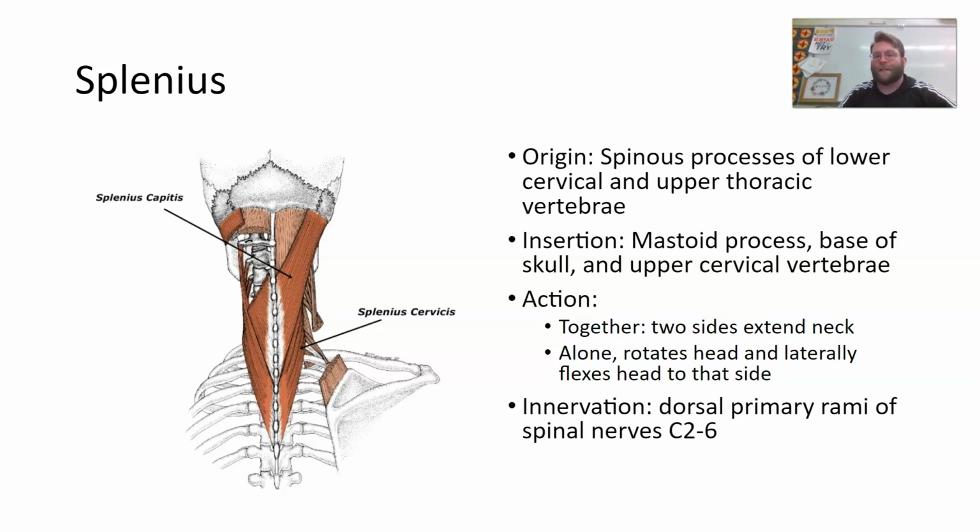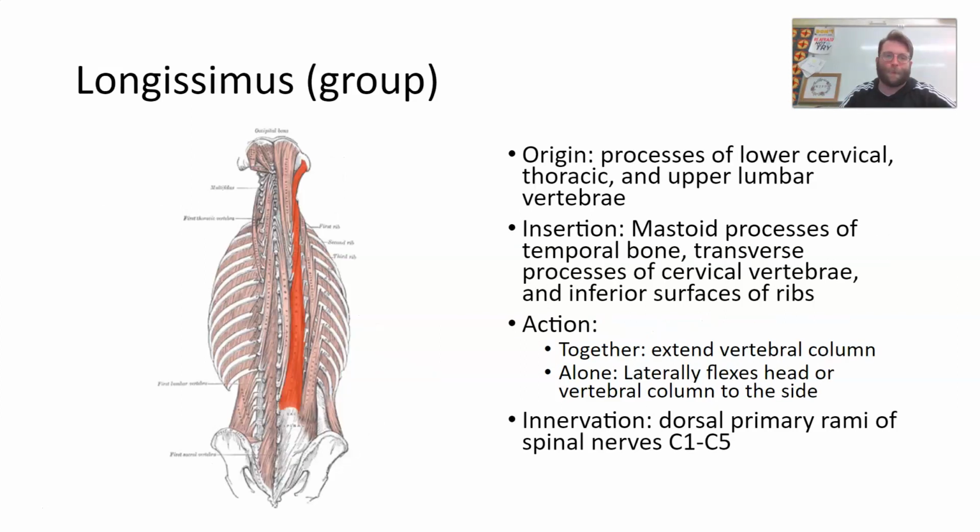In this image, there are a couple of different ways you can split the splenius into the capitis and the cervicis. Can't ever say that word. But with that split, we're just learning it as a splenius, as being this large muscle that shows up in the cat. We have a hard time discerning between the two different parts of it. There's not a good delineation. But just knowing that it's deep and aligned with the levator scapulae, you'll be fine.